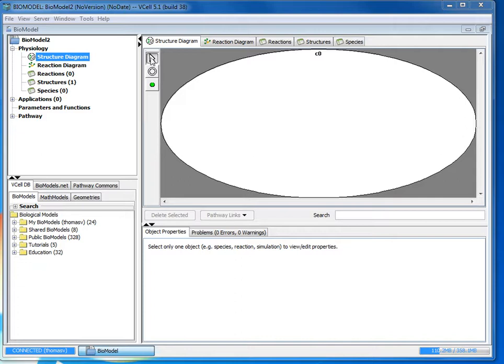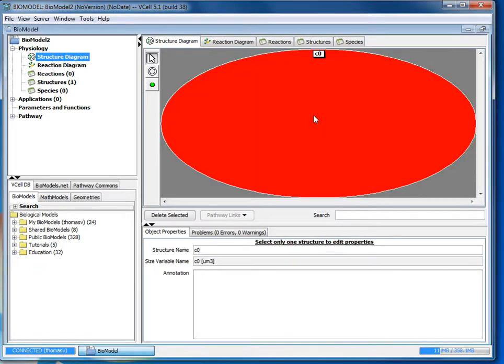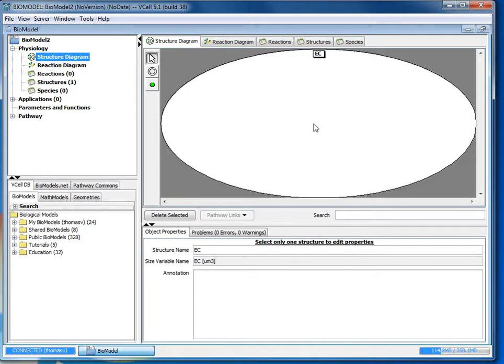So the first thing we're going to do is have the select tool chosen and we're going to click into the white region labeled C0. And in the bottom right we're going to go where it says structure name and change it to EC for extracellular. So this will represent the space outside the cell.